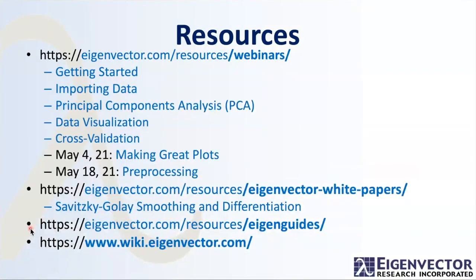I wanted to point out that we're going to have several resources available to you, especially these other webinars that have been recorded that you can have access to. As we move forward, each of these will be highlighted a little bit, like Lyle's going to be loading data up and importing data, getting started.